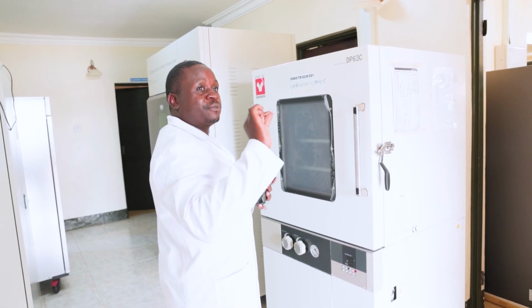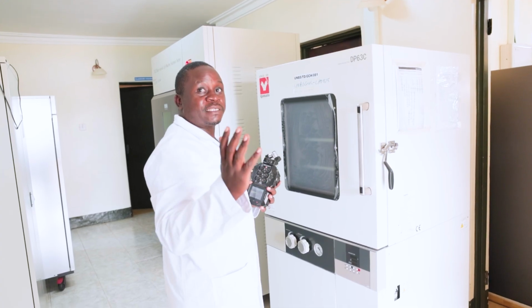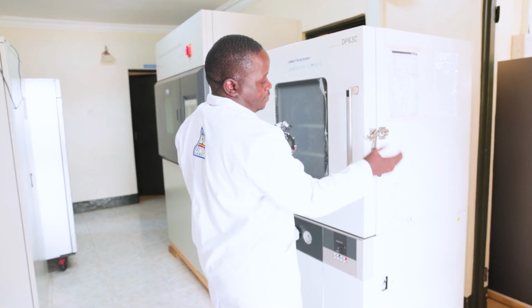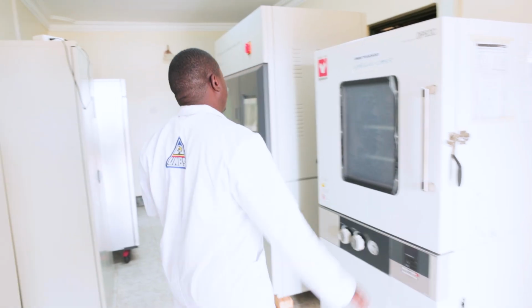But now it's supposed to contain very minimal amounts that are acceptable, because when it's too much then the oil will go bad very fast, it will oxidize. So this equipment we use for analysis of moisture content in oil. It's a vacuum oven. This one, yes.